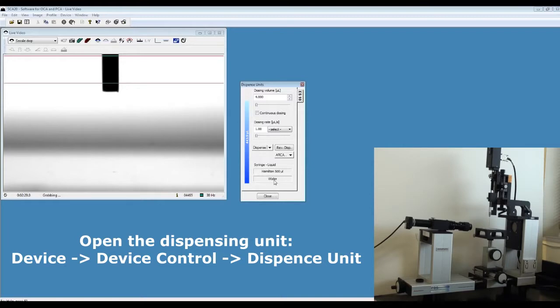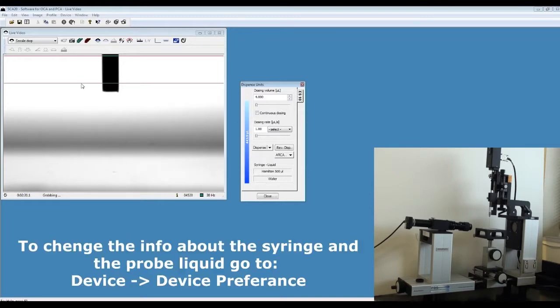If you want to change either of these, go to Device, then Device Preference.